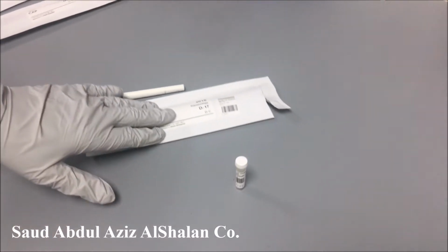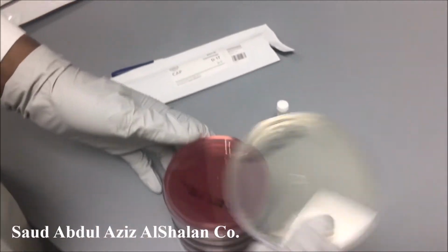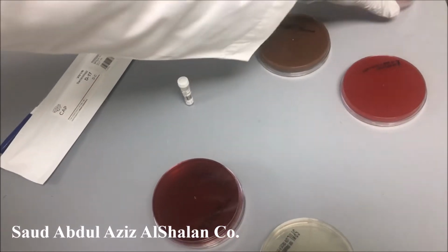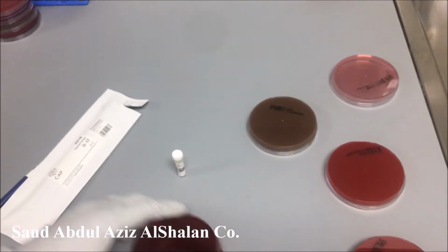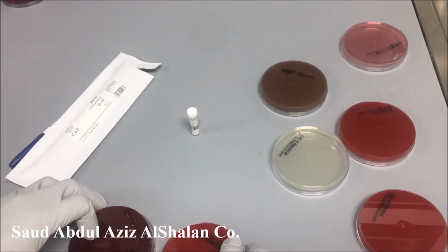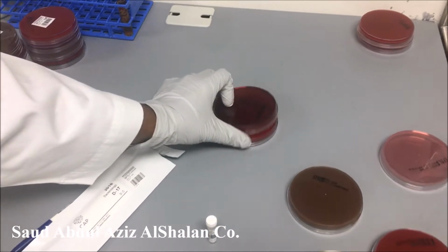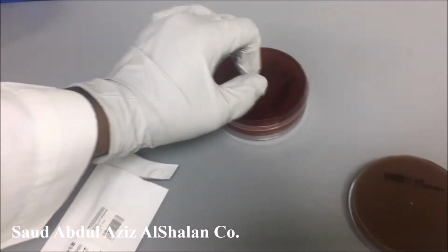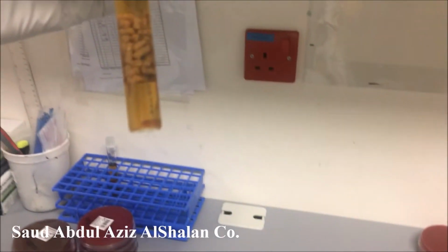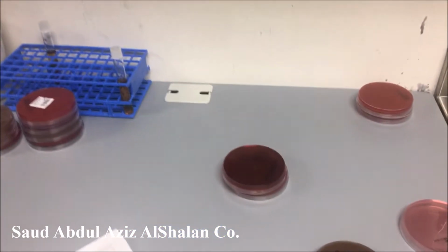Now we come to the third specimen, which is wound. For wound, we are using blood, chocolate, MacConkey, Columbia, and Sabouraud, and all of these will be incubated aerobically. In addition, Brucella selective media and LKV media are for anaerobic, in addition to the cooked meat as enrichment media. We will label it again.